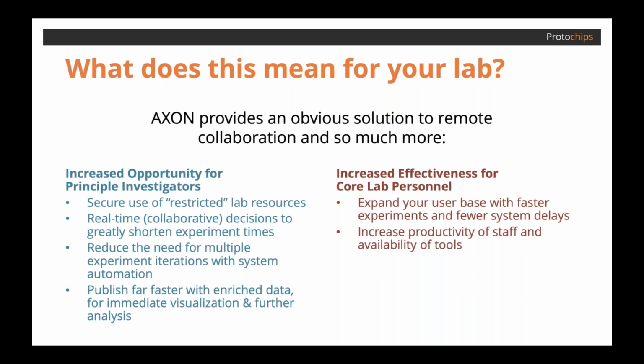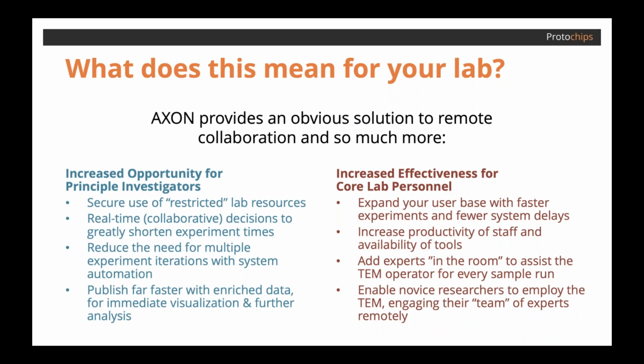Of course, the increased productivity of your staff and all the available tools. And the collaborations allow experts, quote unquote, in the room to assist the TEM operator for every sample run, again, accomplishing the goal faster. And it enables novice researchers to engage your TEM experts, to progress their projects along faster.